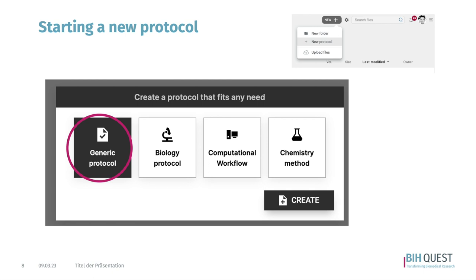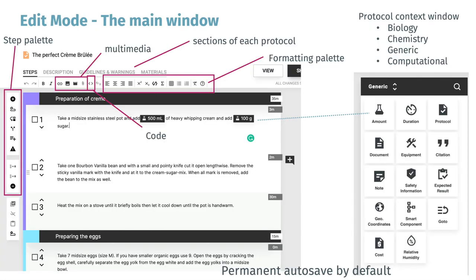I would start with the generic protocol because that gives you lots of great options. Just check them out and see what is behind each one. After you select a template and click create, it brings you to the editing mode — this is the main window you will work with. On top you see the name of the protocol, here called 'the perfect crème brûlée', and in orange you can see that it is currently in draft mode.